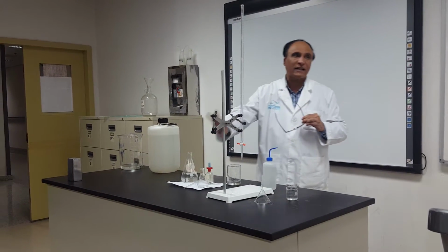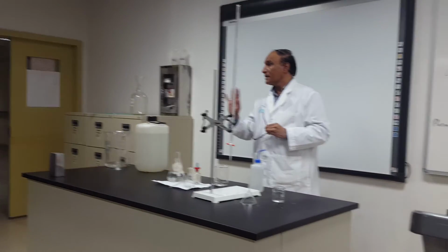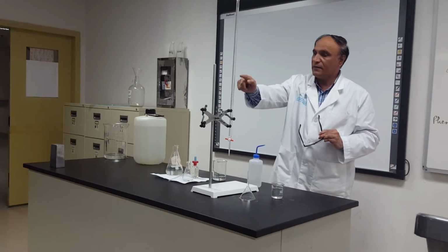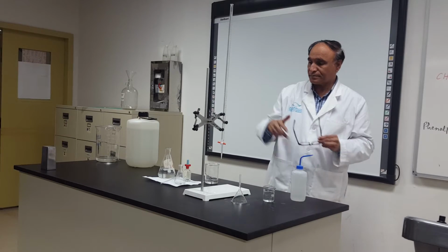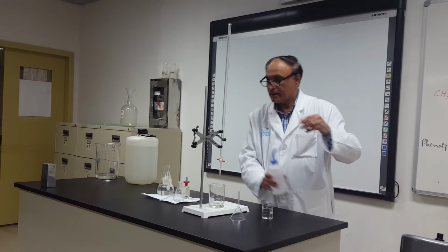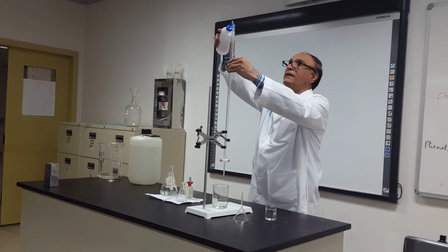One student has done like that. Out of 2, one student did this job. The other student, what he will do? When he is doing this job, he will not wait for him. He will fill it with sodium hydroxide. This is the burette, and I will put already washed with the tap water, and see what I am doing.